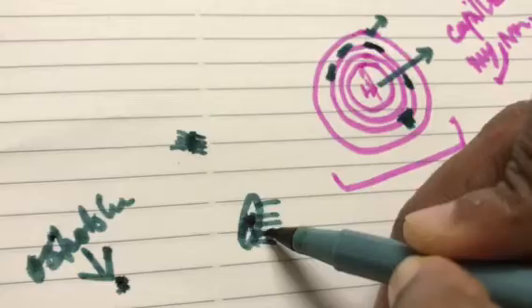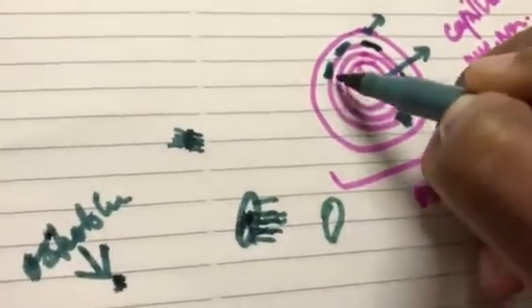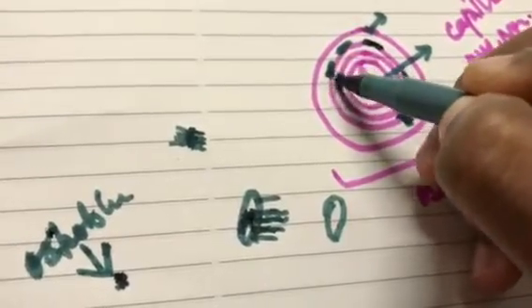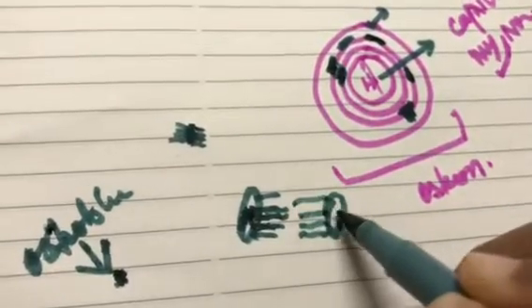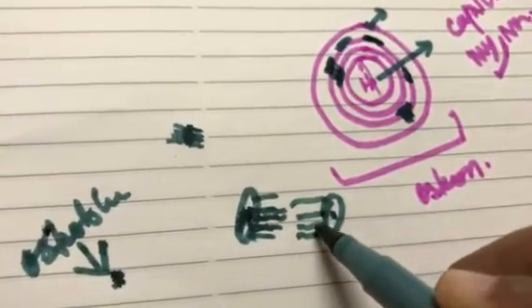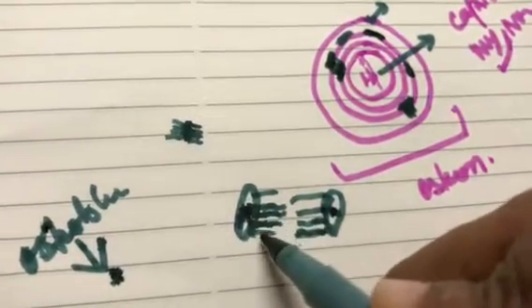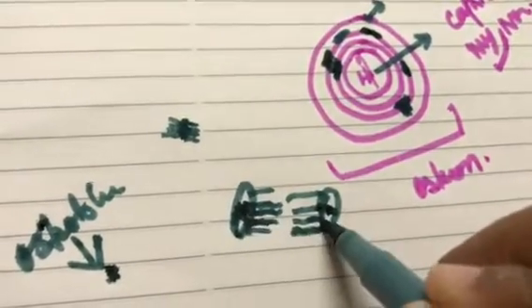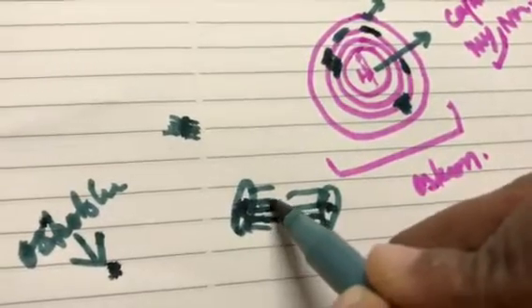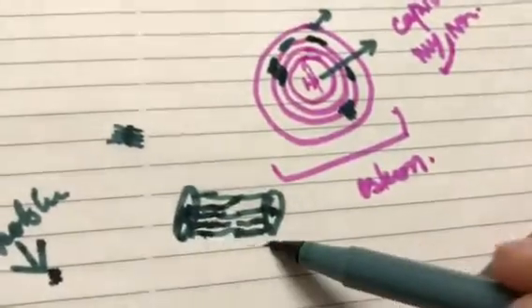So this is the osteocyte, and this is the canaliculi. The osteocyte's processes are present inside the canaliculi. So here one osteocyte, here one osteocyte. These two lacunae are communicated by the canaliculi. What is the role of this canaliculi? The cytoplasmic processes of the osteocyte, the legs of the osteocytes, are here. From this lacuna to this lacuna, through this canaliculi, the nutrition and everything is transmitted to this osteocyte. Understand?